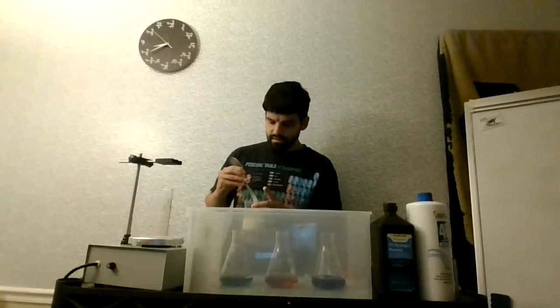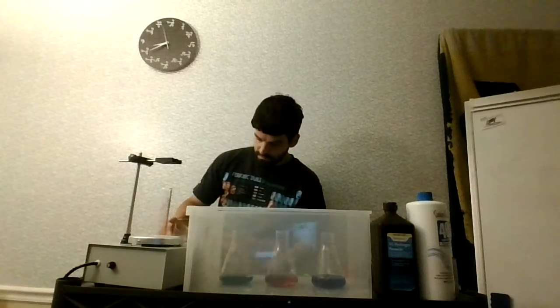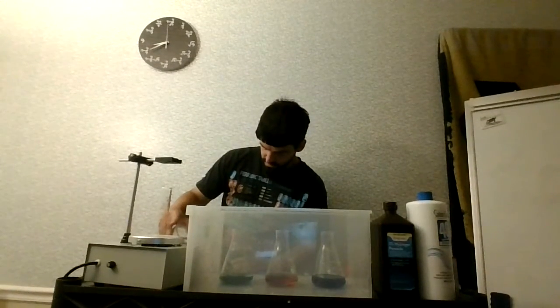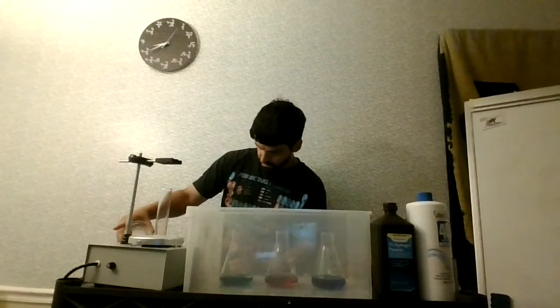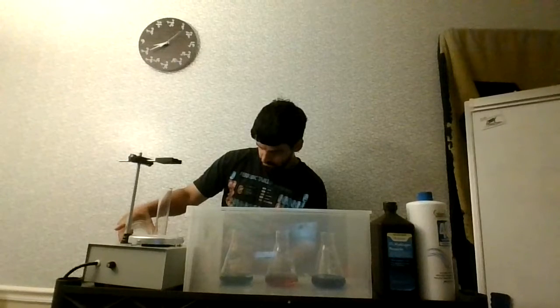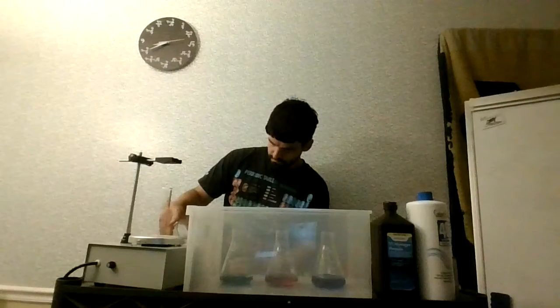Good. It does have a putty-like consistency, but I'm not going to use the entire thing. So what I'm going to do is add 20 mils to this one, add 20 mils to this one. We can probably go to 30 and we should be good. And as we continue to talk about this experiment, we're going to notice that the addition of a catalyst is only beneficial to a particular point. So we'll keep going with that.